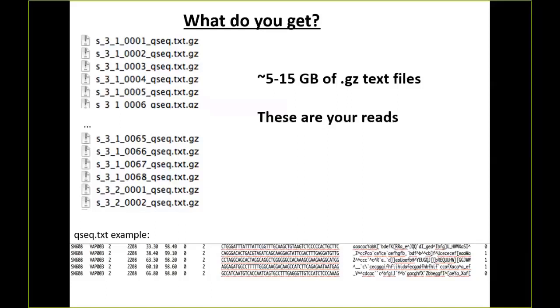Some of the workshops are generically useful. Like this one doesn't cover any specific application, but I'm covering a lot of general purpose sequencing stuff. You'll learn a lot about the sequencing technology, and the technology I'm describing here still gets used in single cell. There's just some additional, very complicated steps that happen first.